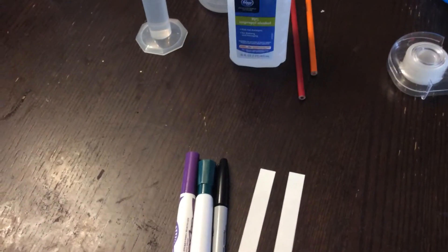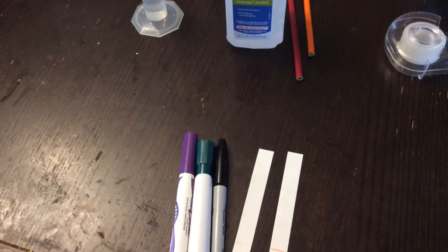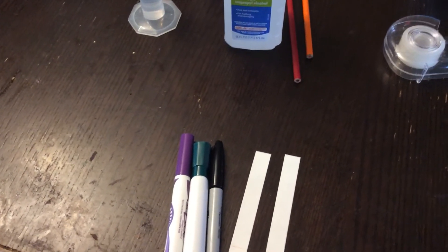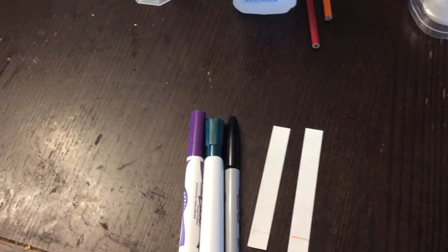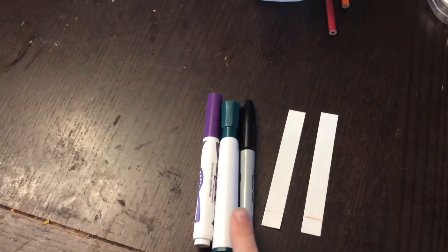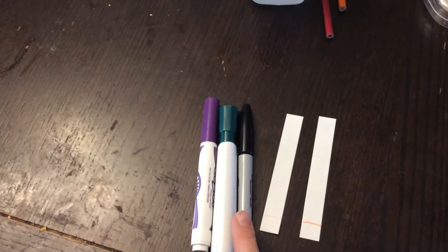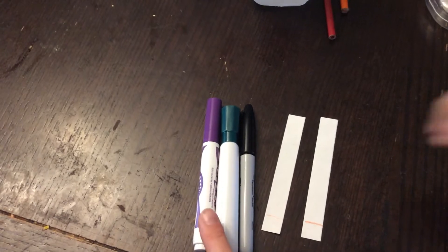Hi everyone, in today's experiment we are going to do some paper chromatography. Paper chromatography is a way that you separate ink into all of the different colors that are in the ink.